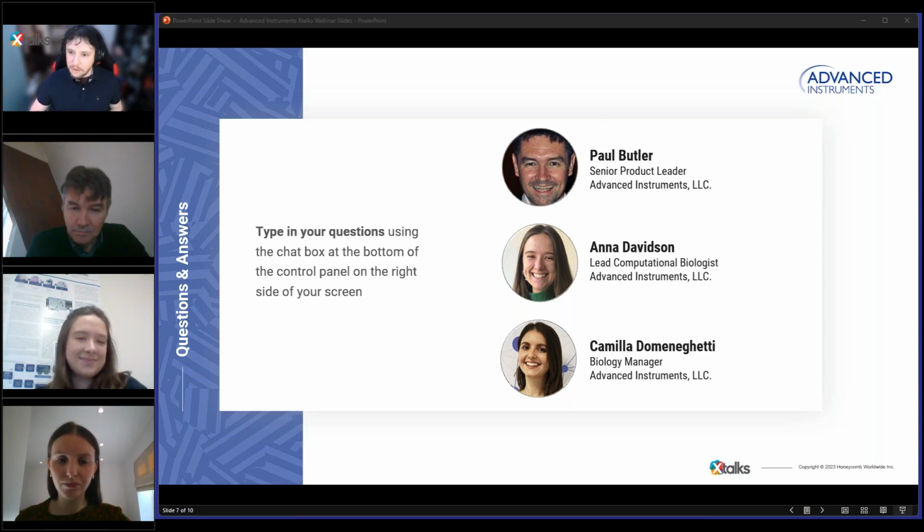Very good to know. Thank you so much. So our next question here is asking, is AEC available on VIPS Pro? Currently, the VIPS Pro is our automated single seeding system, and it's currently not available, but watch this space.